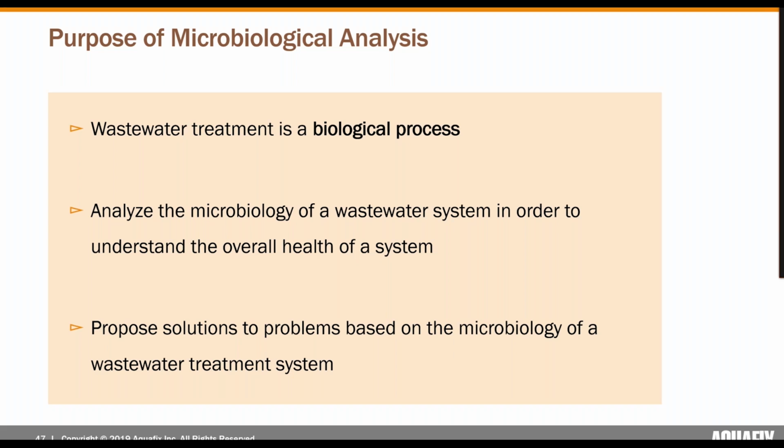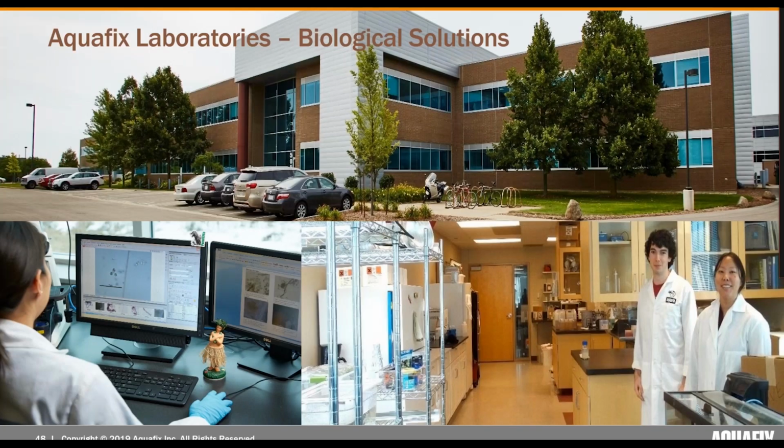Our goal here is to support happy and healthy bacteria in order to facilitate efficient nutrient removal and overall water treatment. And so all of our analysis and observations are conducted at the Aquafix laboratories at the University Research Park here in Madison, Wisconsin. Here you can see some examples of our laboratories and where we are actually doing this analysis on wastewater samples.